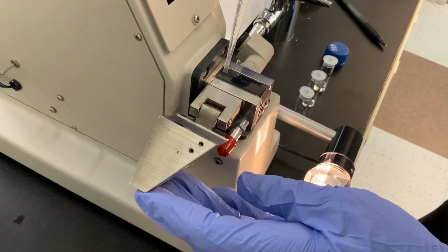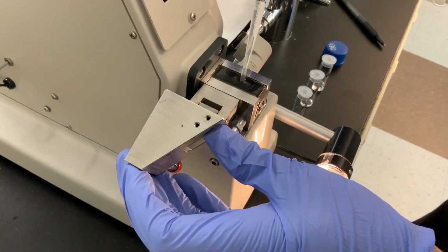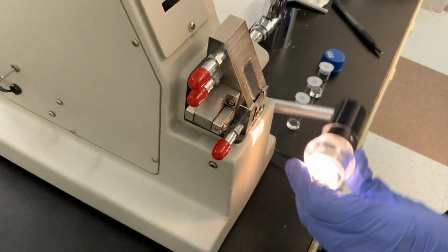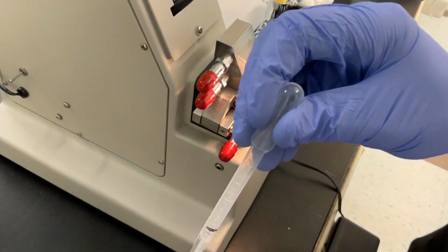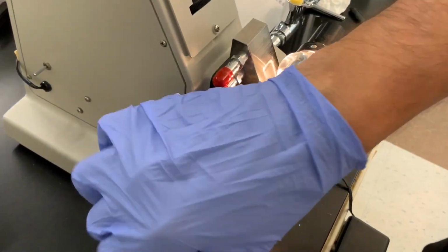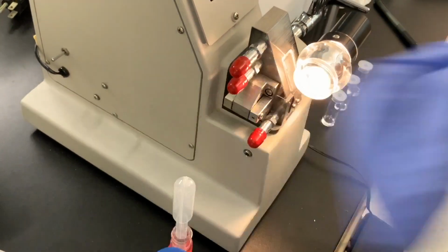Note that I'm using a plastic pipette because I don't want to scratch it with glass. And then I'm setting it down, and now we're ready to read the refractometer.